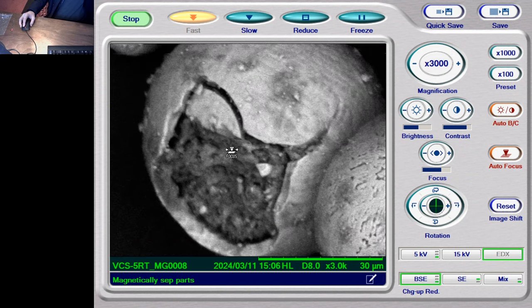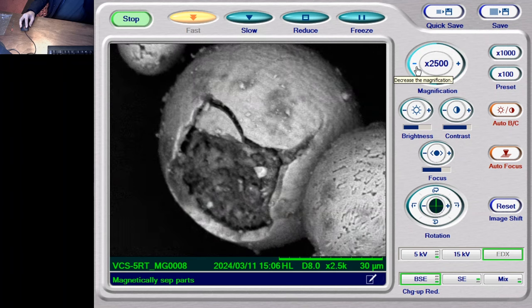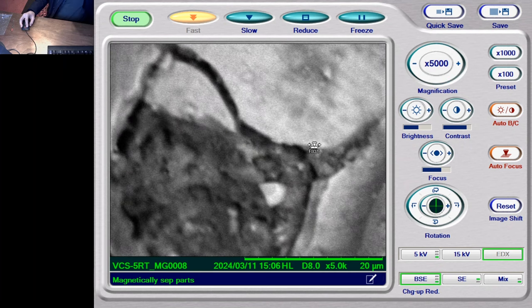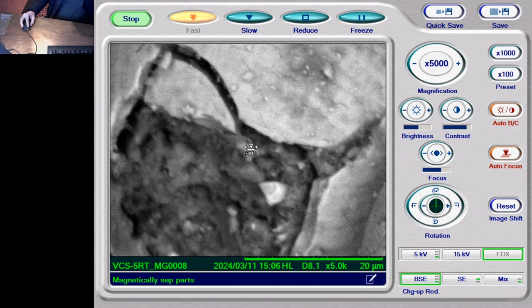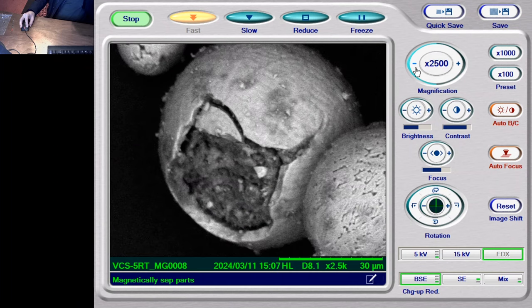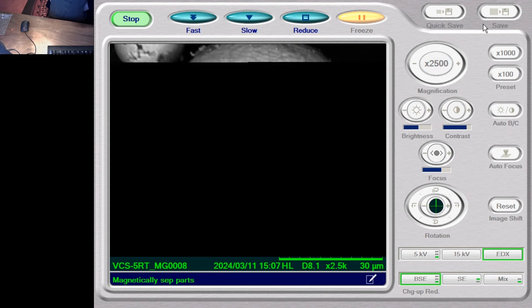And this is basically seeing the inside of an iron-rich crenellated microsphere. Look at that, it's lovely, isn't it? Wow. How beautiful is that? I'll try and capture this edge nice and crisp if we can. No, not like that. Definitely an iron-rich crenellated microsphere. We'll take an image at that resolution and then we'll just dial it back so we can see the whole thing.